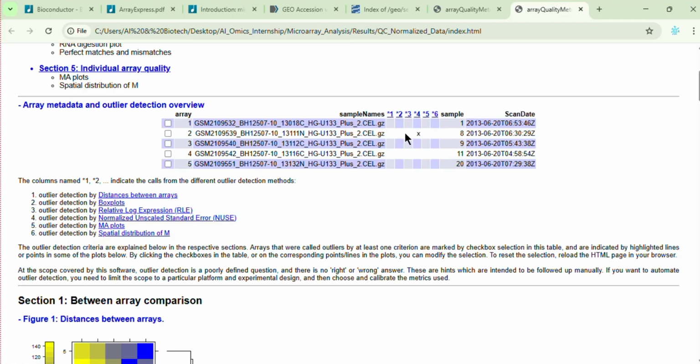So there we can check by using different classification and clustering methods if this sample shows any variability or not. At this time, we will not remove any sample from our data. We keep all the samples as they are and will decide based on machine learning methods.